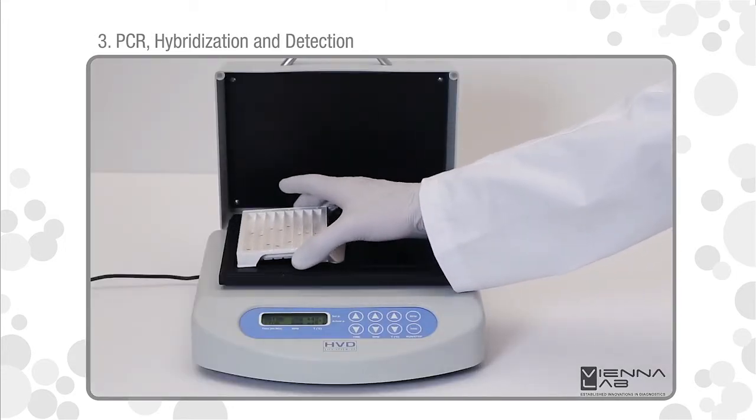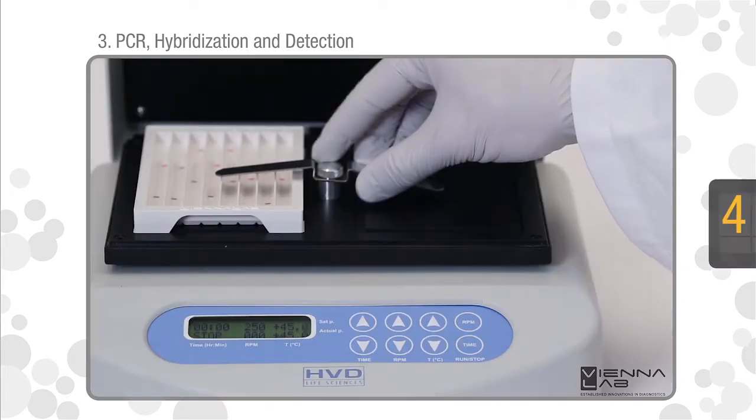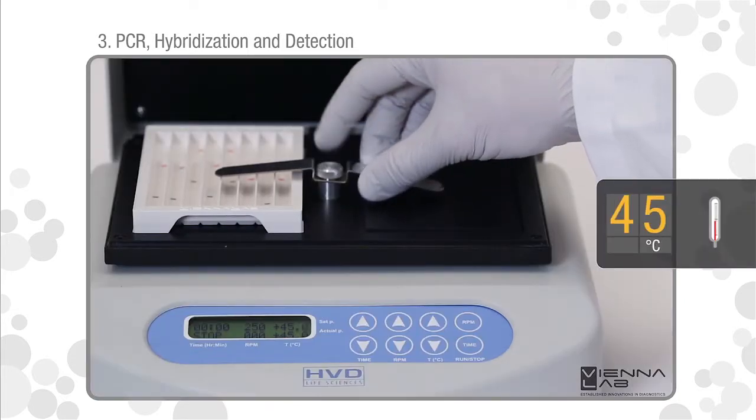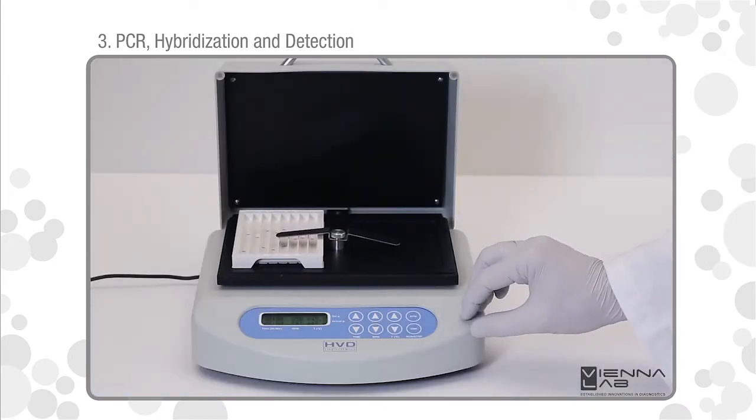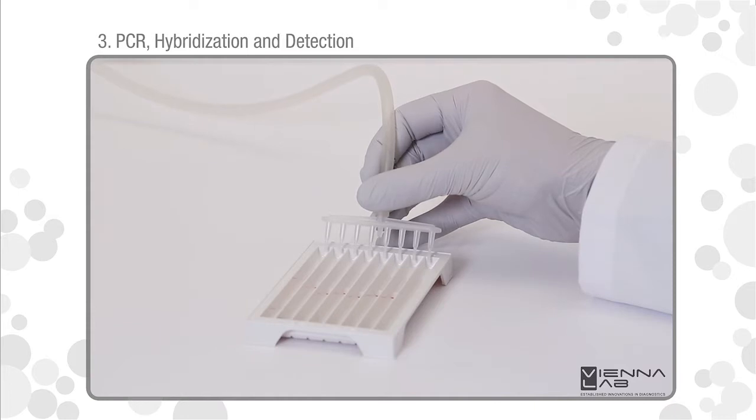You can use a thermo shaker with heated lid instead of a water bath. Set temperature to exactly 45 degrees Celsius and incubate for 30 minutes. Do not use air-based hybridization devices because of insufficient heat transmission.